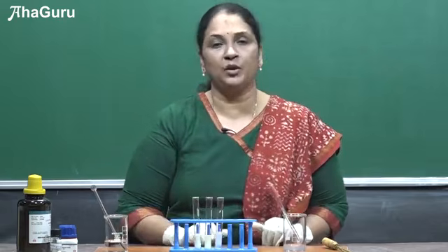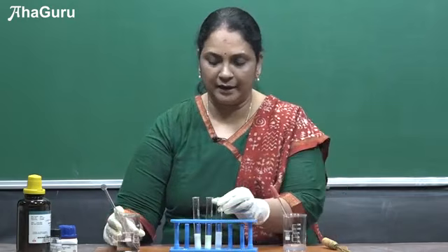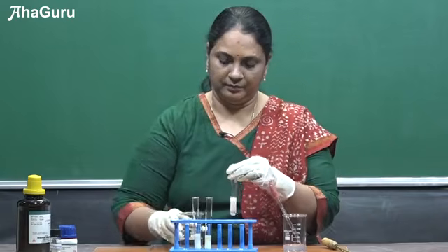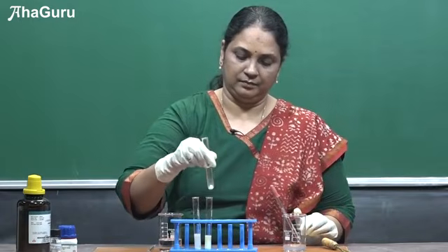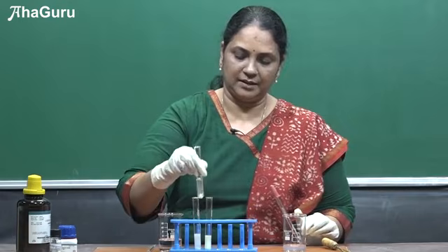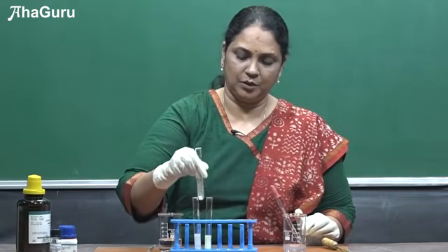Now how do we differentiate? To this we are going to add ammonium hydroxide. Let me add ammonium hydroxide. You can see it is getting solubilized slowly.